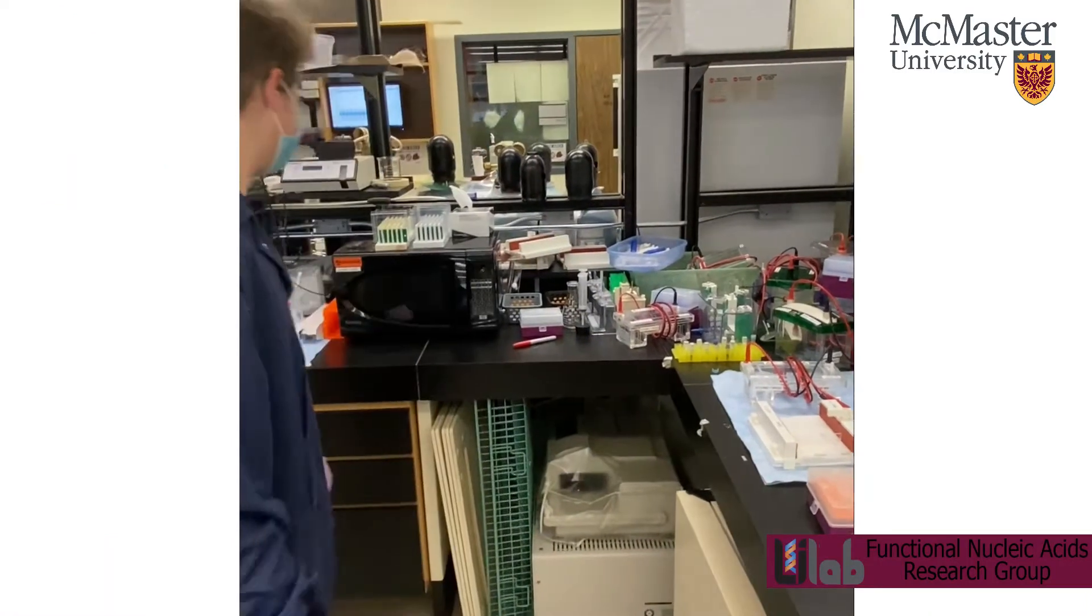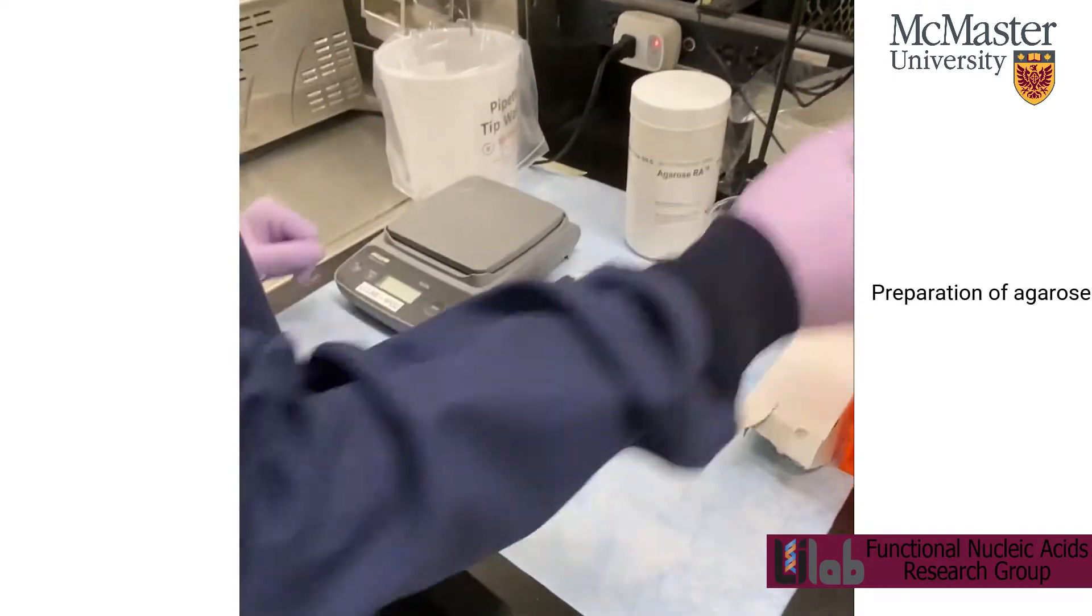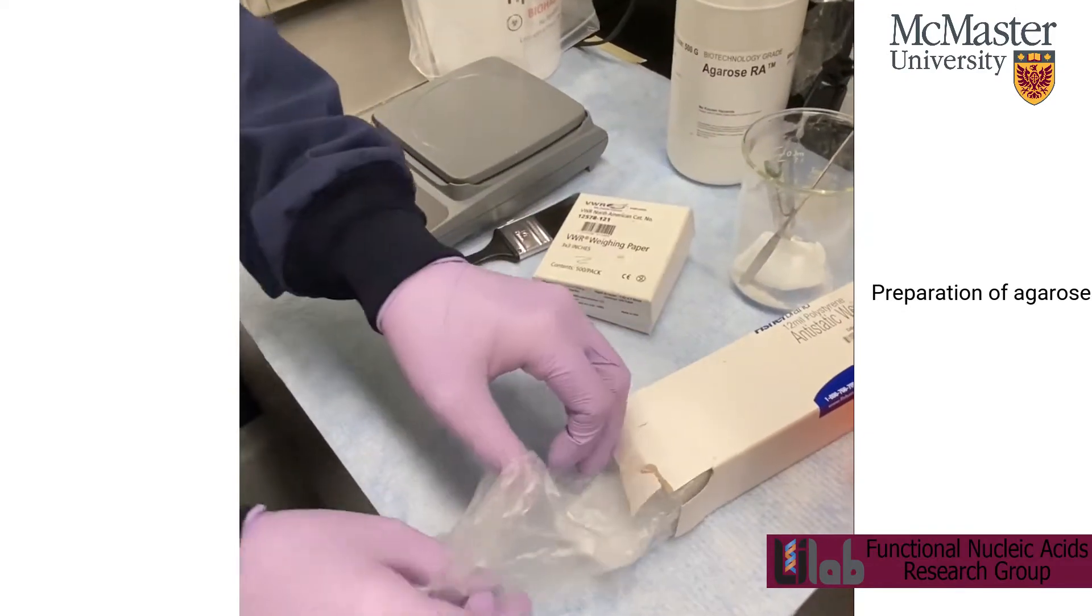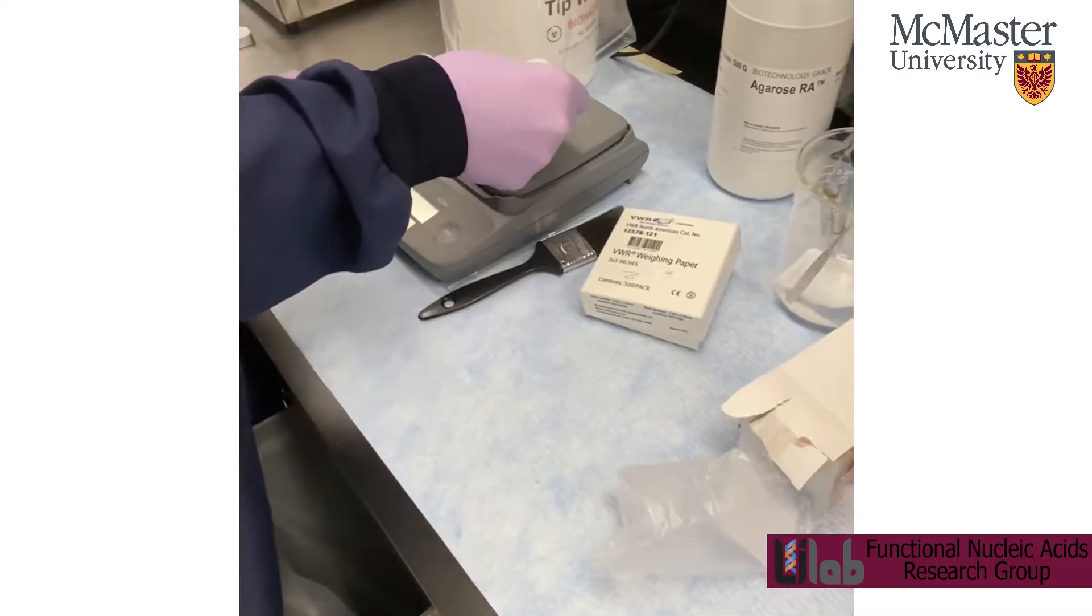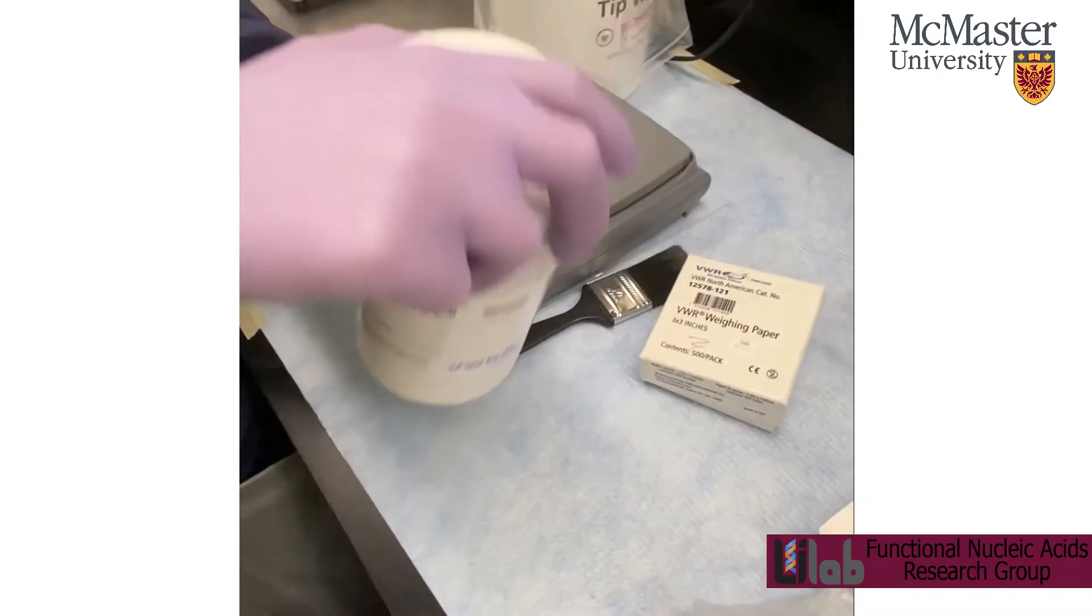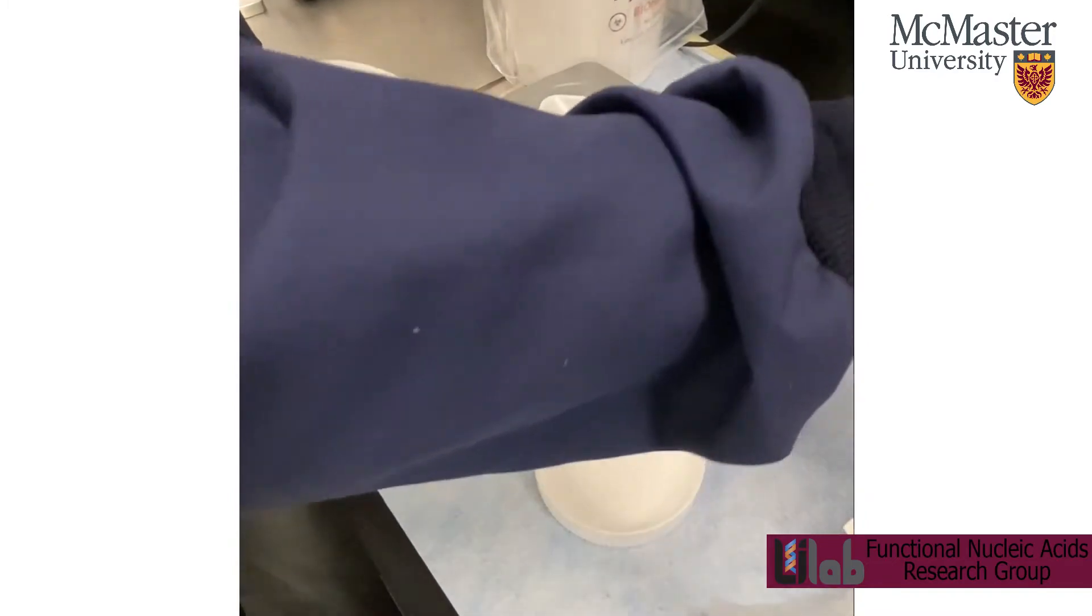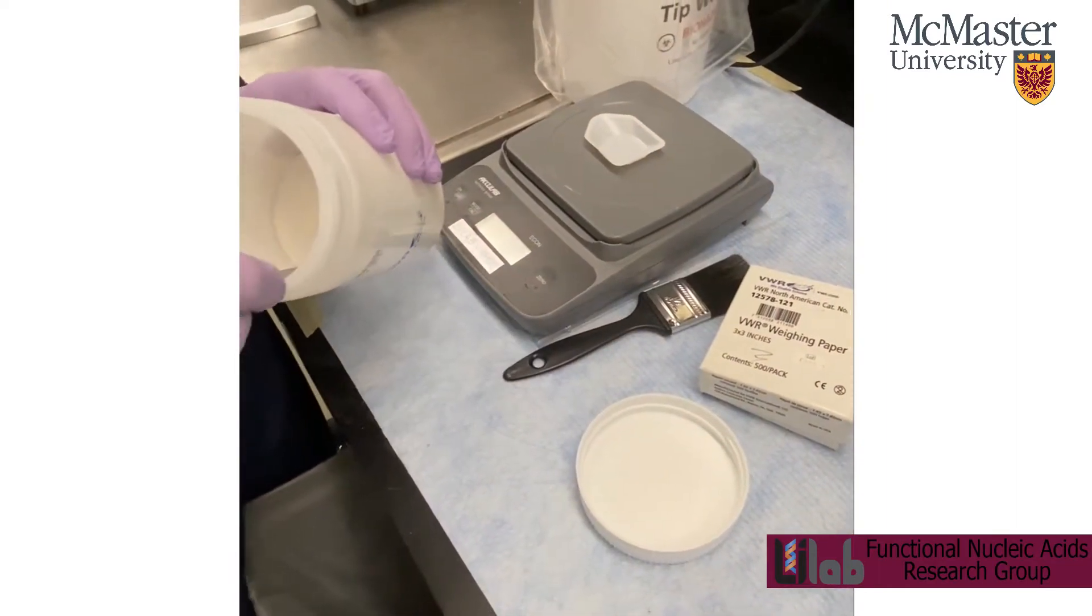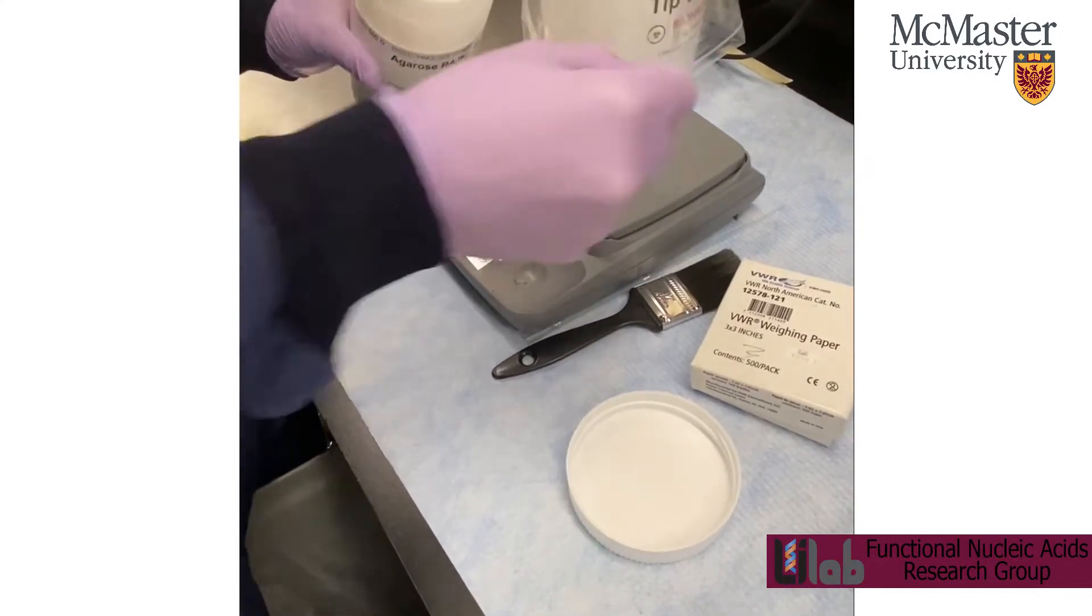So to start you first need to weigh out your desired percentage of agarose. The weighing dishes are in this box here, or the bigger ones are there. So turn it on first. You can start weighing your agarose. Calculate beforehand how much agarose you'll need, and it all depends on what percentage gel that you want to make.